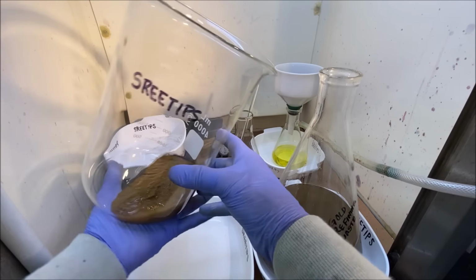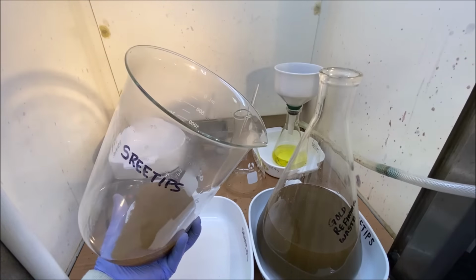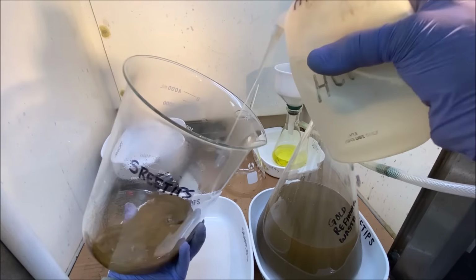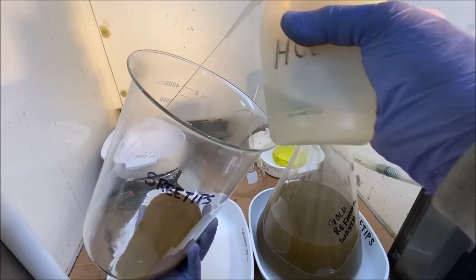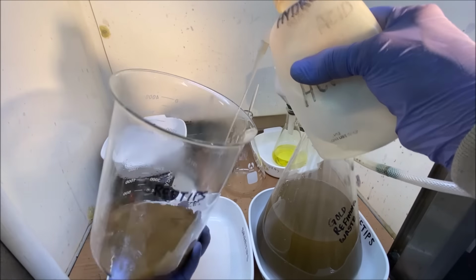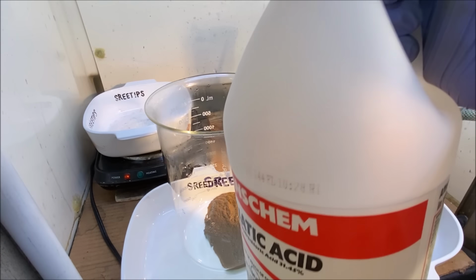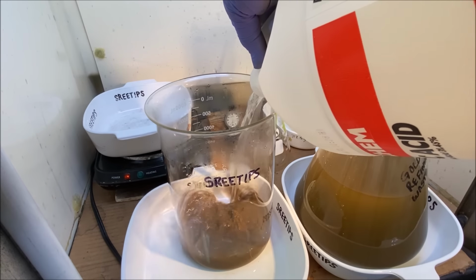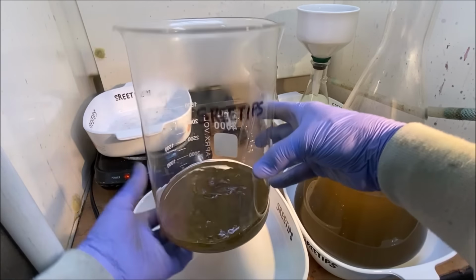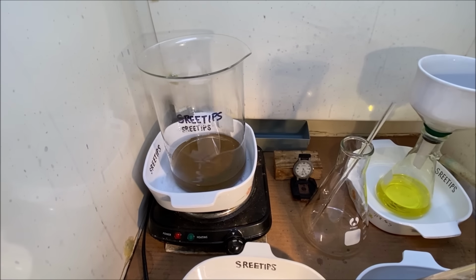Now we'll do the same thing with some hydrochloric acid. Add some hydrochloric acid to the gold. We're going to set it up here on the heat and let this boil right quick in some hydrochloric acid.